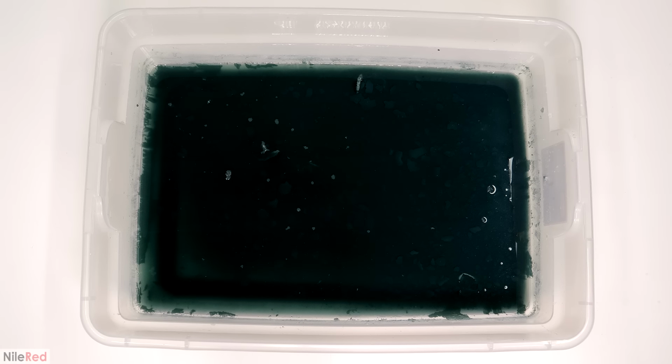Now the last thing that I had to deal with was the bath that I used earlier. The process for this though was pretty much the same as before, except without all those other kind of dumb steps that I added. The initial volume of it was a bit too big, so I just let it evaporate over the course of about a week, and then I transferred it to a smaller dish.